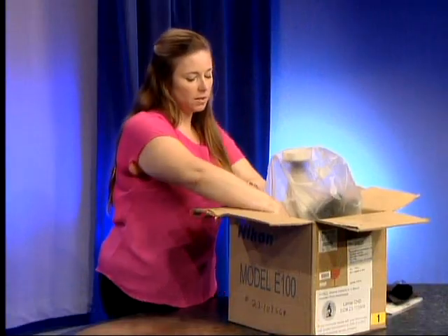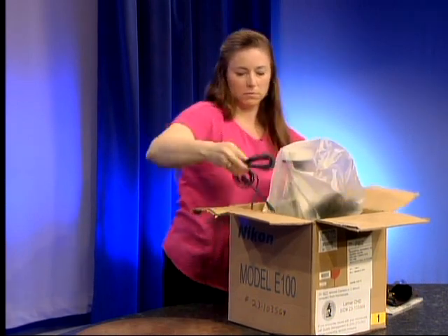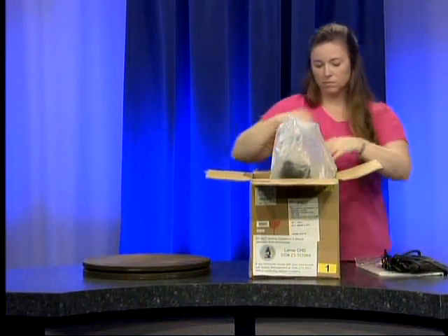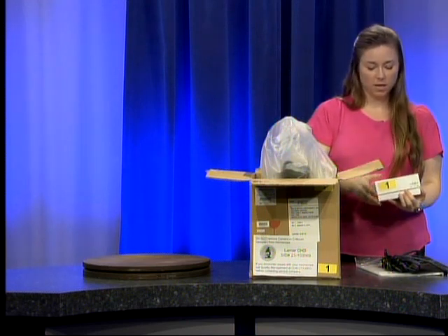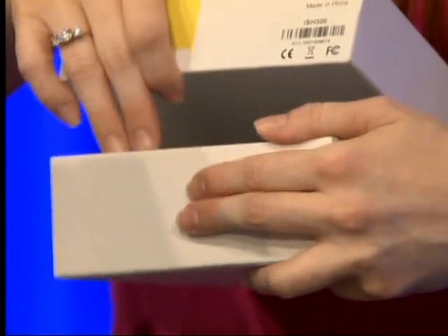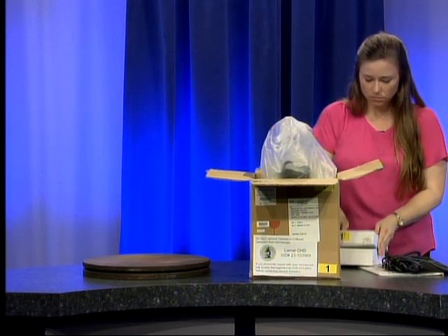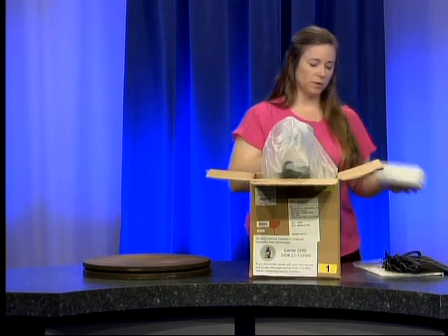Also in the box you will have a black power cord and a blue USB cable — this is 10 feet long. The last item in the box, except for the microscope itself, is this white box. This is the box that the camera was shipped in before it came to be attached to the top of the microscope. Please check inside to make sure it's empty; if it's not, let us know. We use this box for bracing inside, so you may want to keep it for bracing in the future when you transfer the microscope.